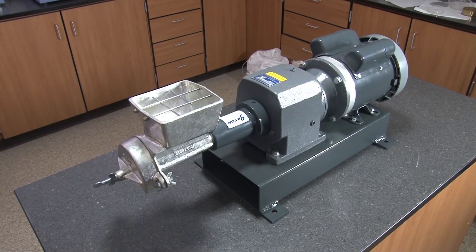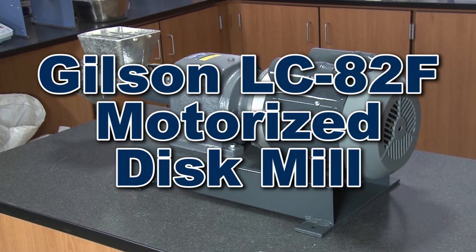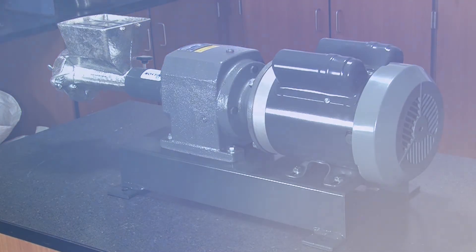And all components can be easily reached for cleaning and maintenance, making the Gilson LC82F Motorized Disc Mill the right choice for your material grinding needs.